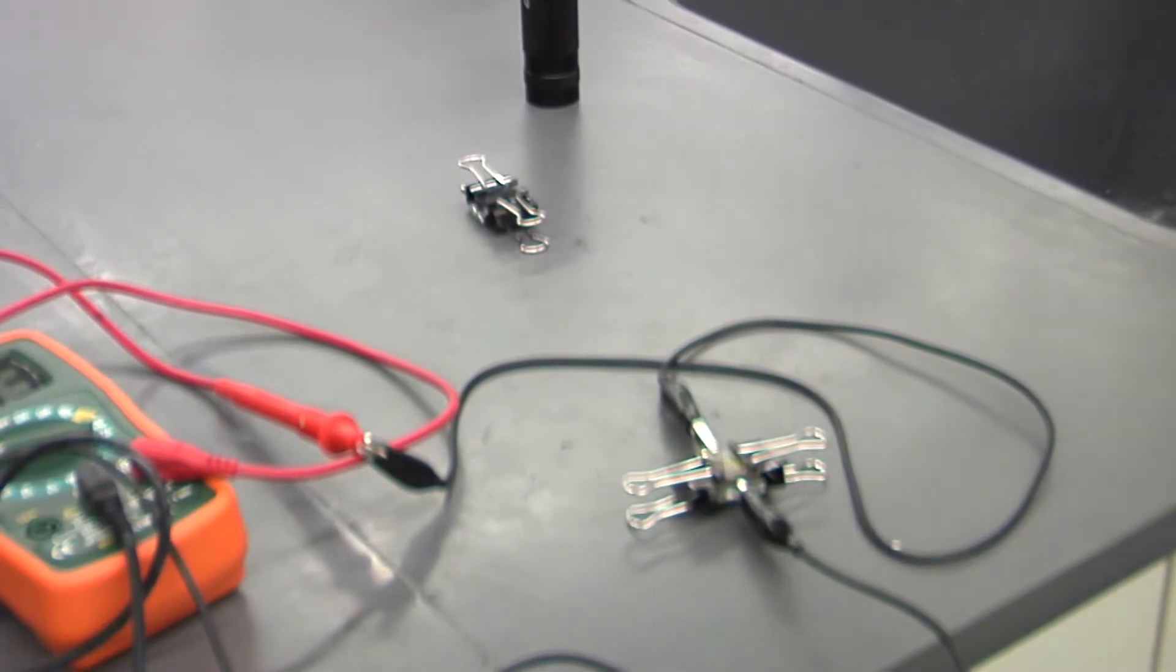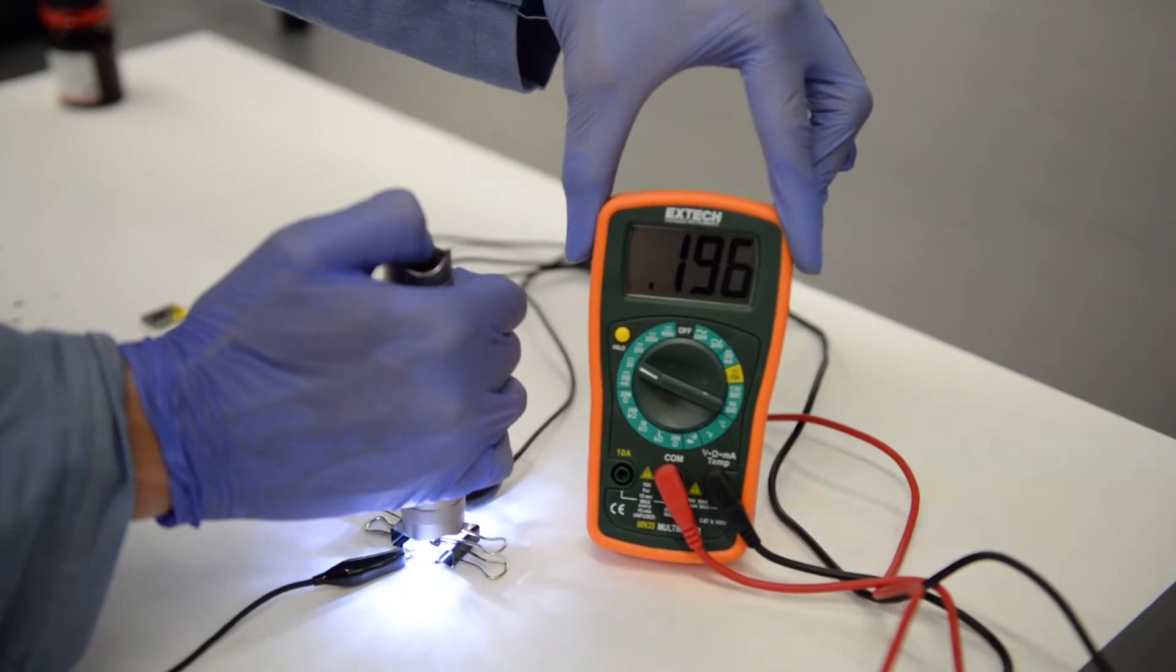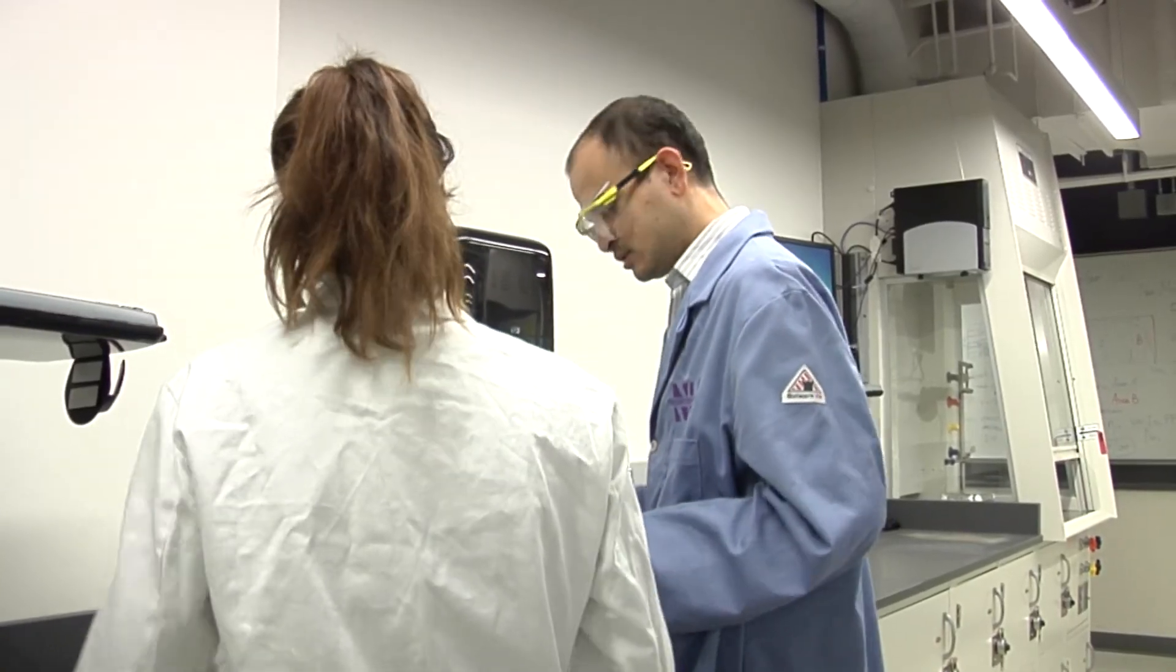The efficient solar cells created today show that in undergraduate labs, this design's future is bright. At Northwestern's Evanston campus, Melissa Shankman from Medill.